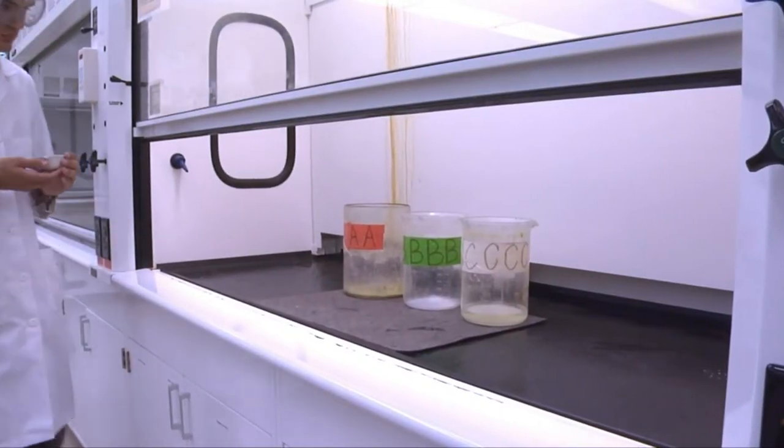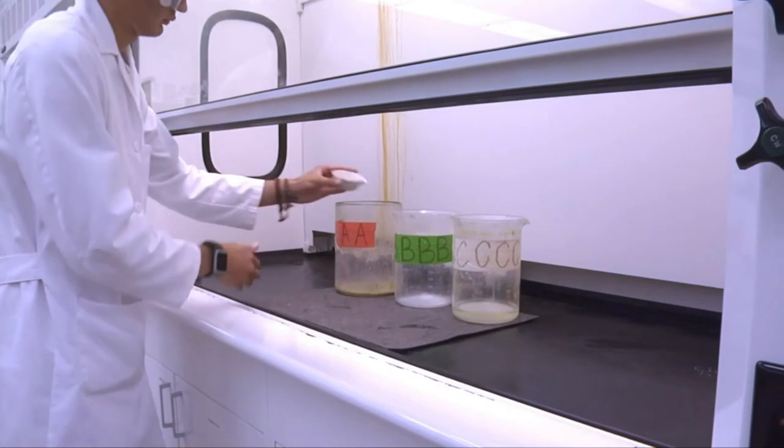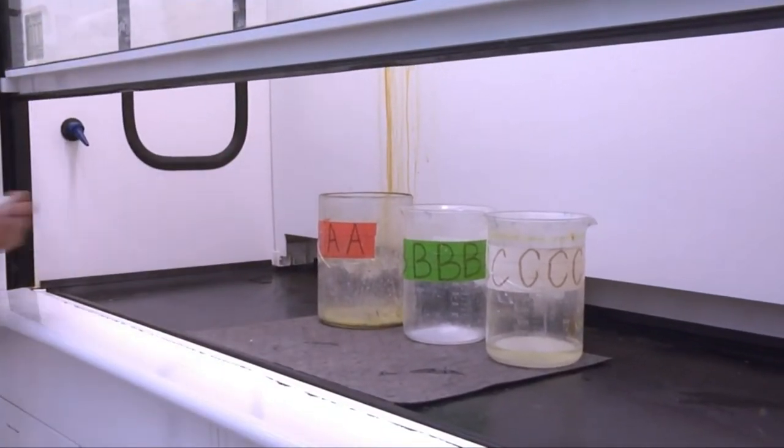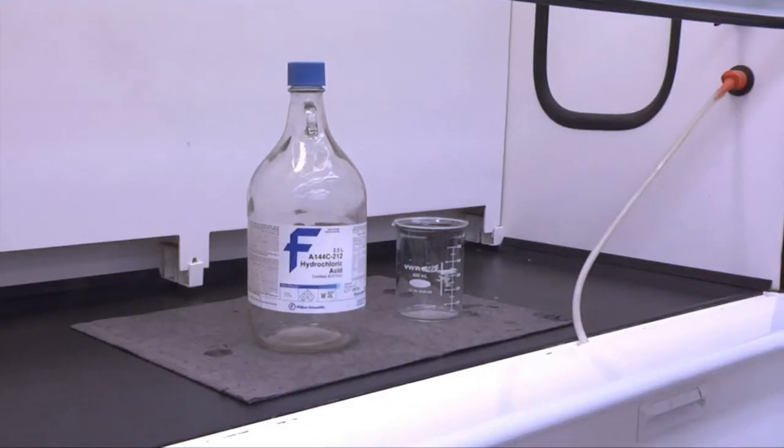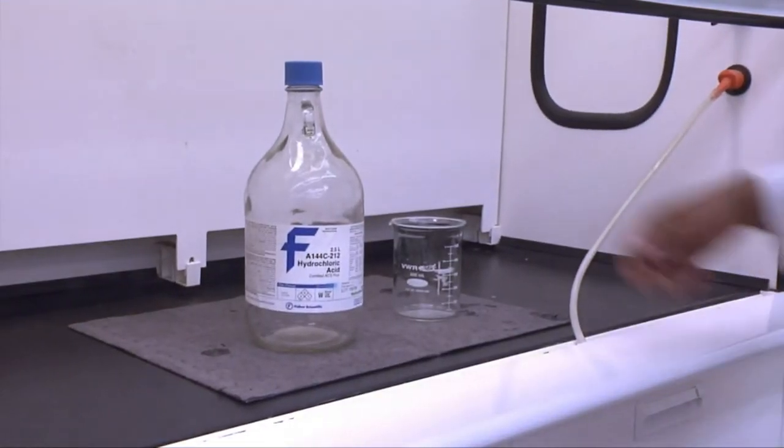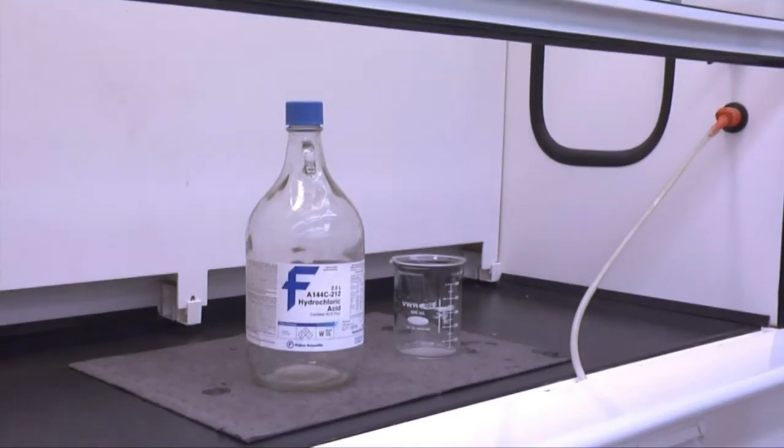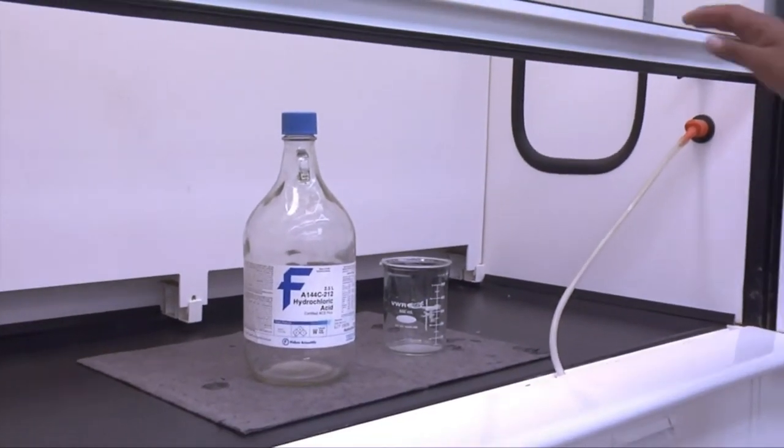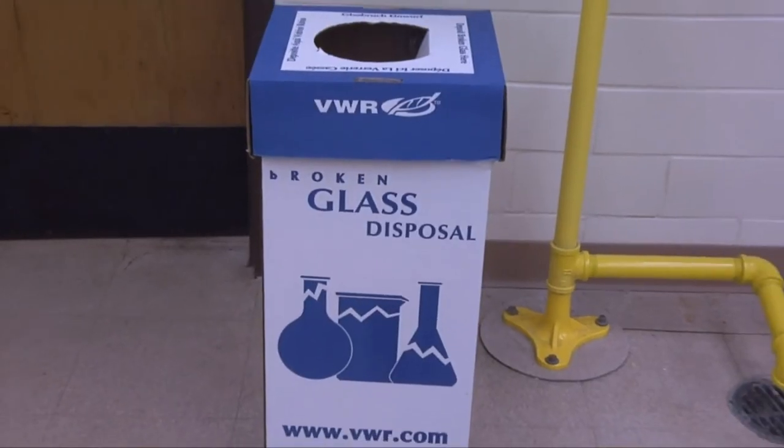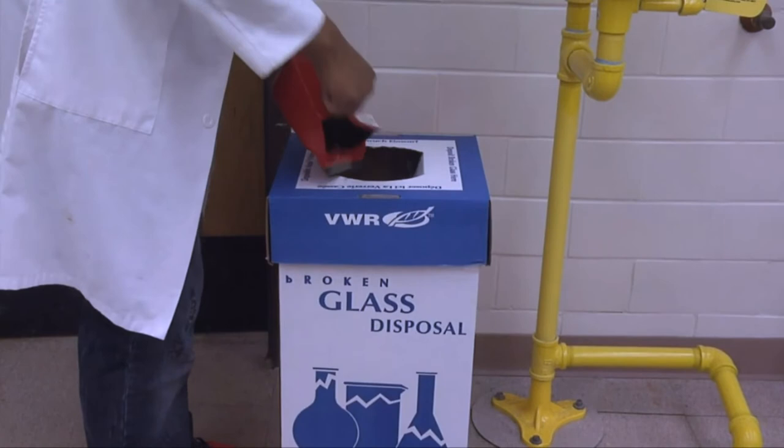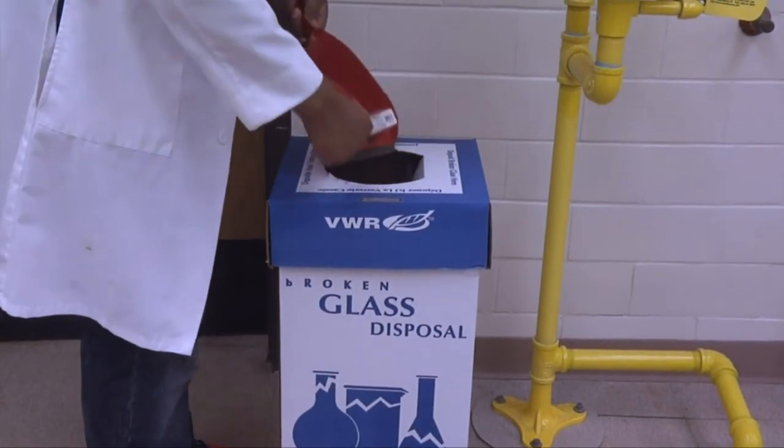Throw away trash in the appropriate containers. Follow the directions of your instructor for discarding waste from that day's work. These instructions must be followed carefully. Disposing of chemical wastes in the wrong way may result in dangerous reactions. Always ask if you are unsure. Broken glass should be discarded in the designated waste containers. Never throw glass away in the trash cans.